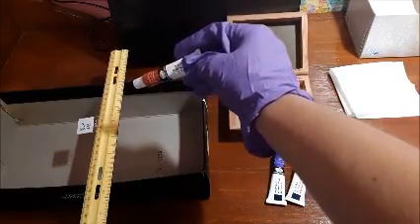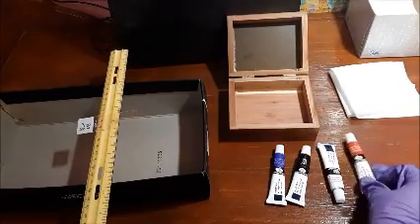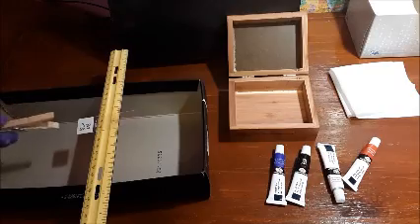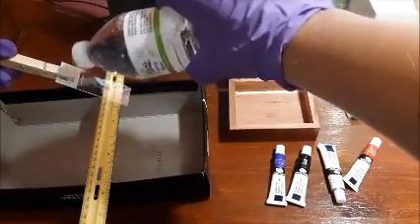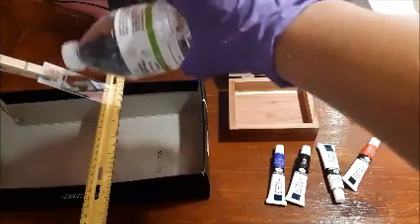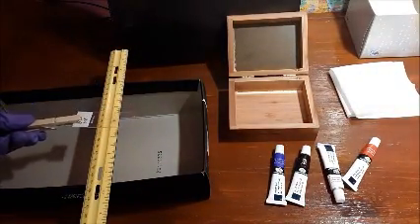So I'm going to speed this up a little bit. After you've applied the safranin for 35 seconds, put that back down. And then what you're going to do is take your slide clip, grab the slide up, tilt it downwards, and rinse the slide off with water gently. You want to get that excess safranin off. Once you've done that, put it back down on the stain tray.